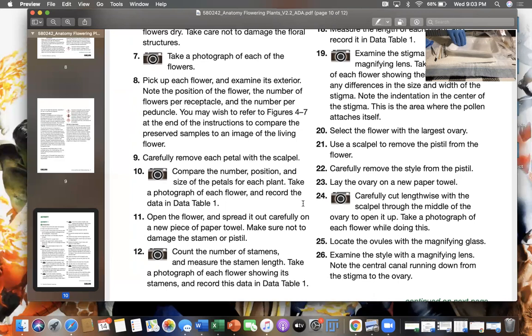It's all covered with even the flowers that you cut off. I would throw these also right into said bag. They have the preservative in them. And I would throw anything that you don't need also into said bag.